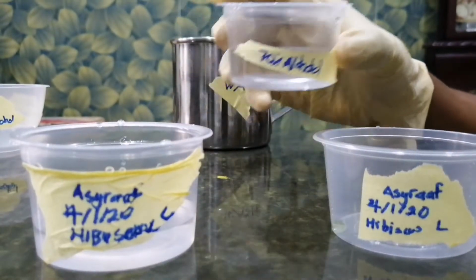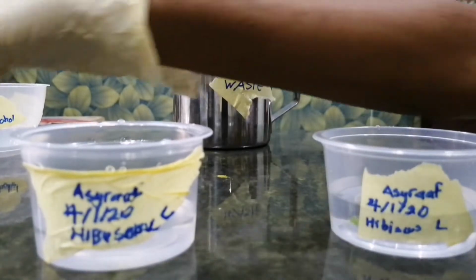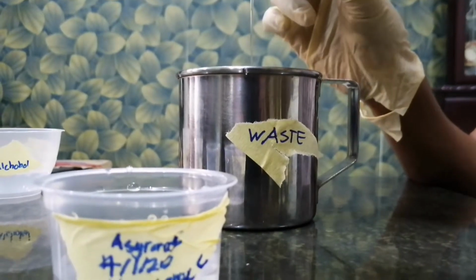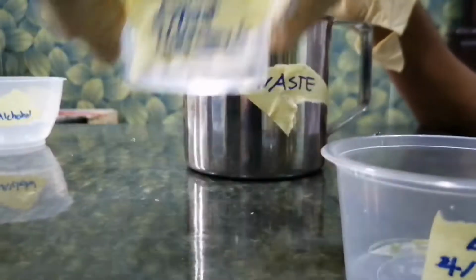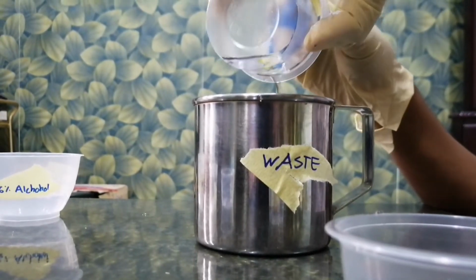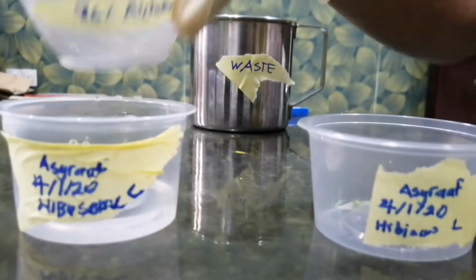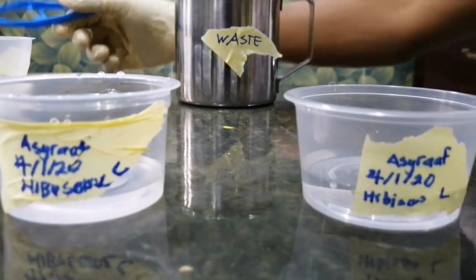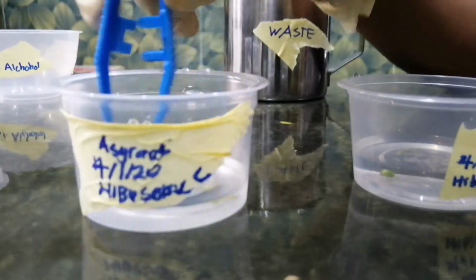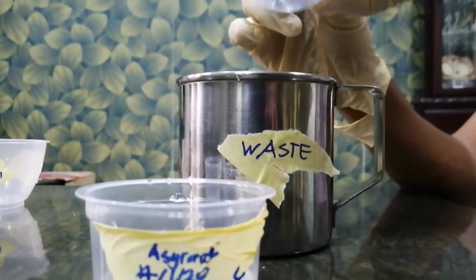So to start the serial dehydration, the specimens will be immersed in 70% alcohol for 30 minutes. Then, the 70% alcohol is removed. For the second part of the serial dehydration, the specimen will be immersed in 96% alcohol for 30 minutes. After that, the 96% alcohol is removed.